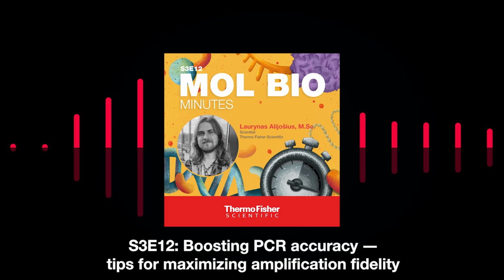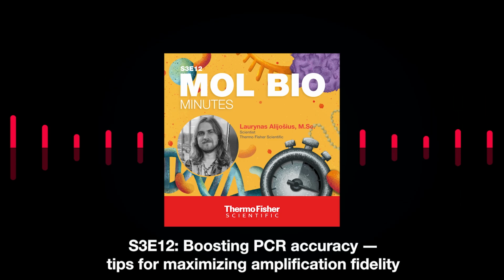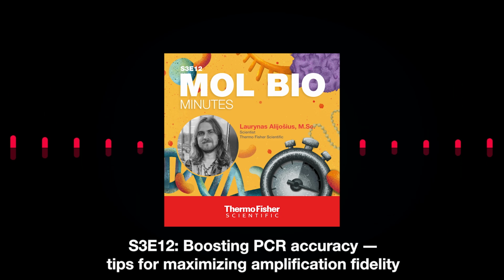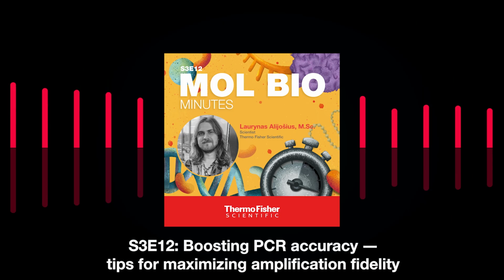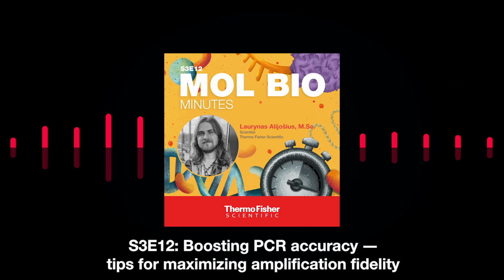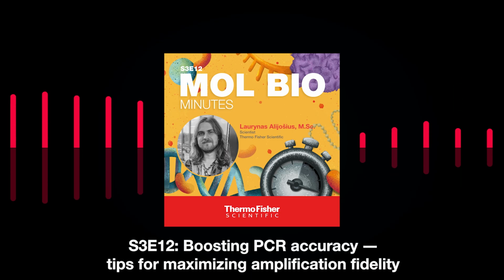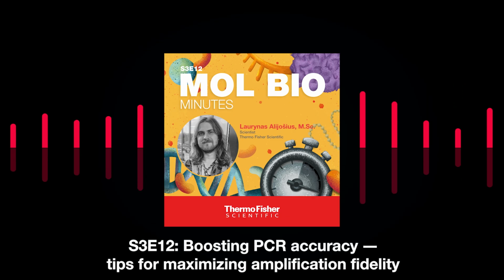That can also be called 3' to 5' proofreading exonuclease activity. If the polymerase lacks this activity, it cannot fix its own amplification errors that it made during the DNA synthesis. PCR accuracy can also be impacted by other components of your PCR reaction.